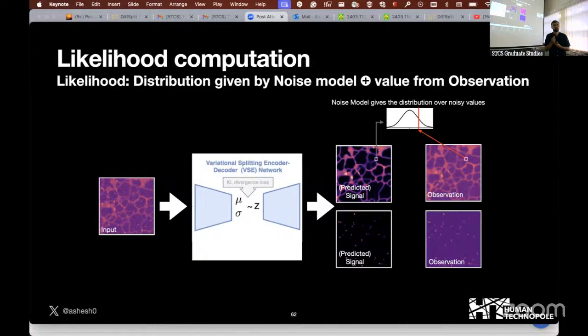So it's like mu plus N(0, sigma squared). Yes, closer. And the noise is independent of which pixel it is, it's not a fixed sigma. Yes. It is a property of the microscope. It is a property of the microscope configuration. Yes.